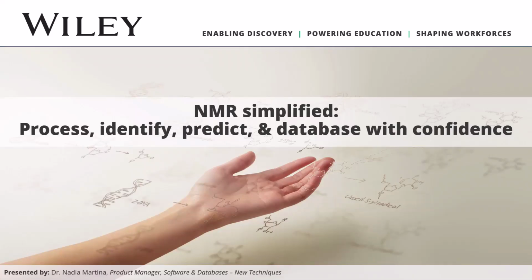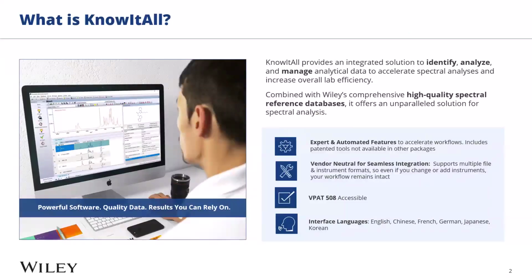Thank you for that introduction. As mentioned, I will be presenting on KnowItAll's NMR tools, where KnowItAll simplifies the workflow, making it accessible to all levels of NMR users. KnowItAll software is an interface that provides an integrated solution to identify, analyze, and manage your analytical data from different techniques. It is also home to the Wiley Spectral library collections.